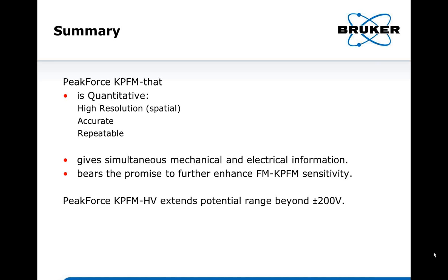Another question here on PeakForce mode. Does it lead to faster tip wear, or what is the situation with tip wear, tapping versus PeakForce? Actually, we have quite an intensive study on the tip wear for PeakForce tapping mode. Since it allows you to use a much smaller spring constant, the tip wear can be much smaller, and you can also use very small force. So the tip wear is actually much better than tapping mode with a stiffer lever.